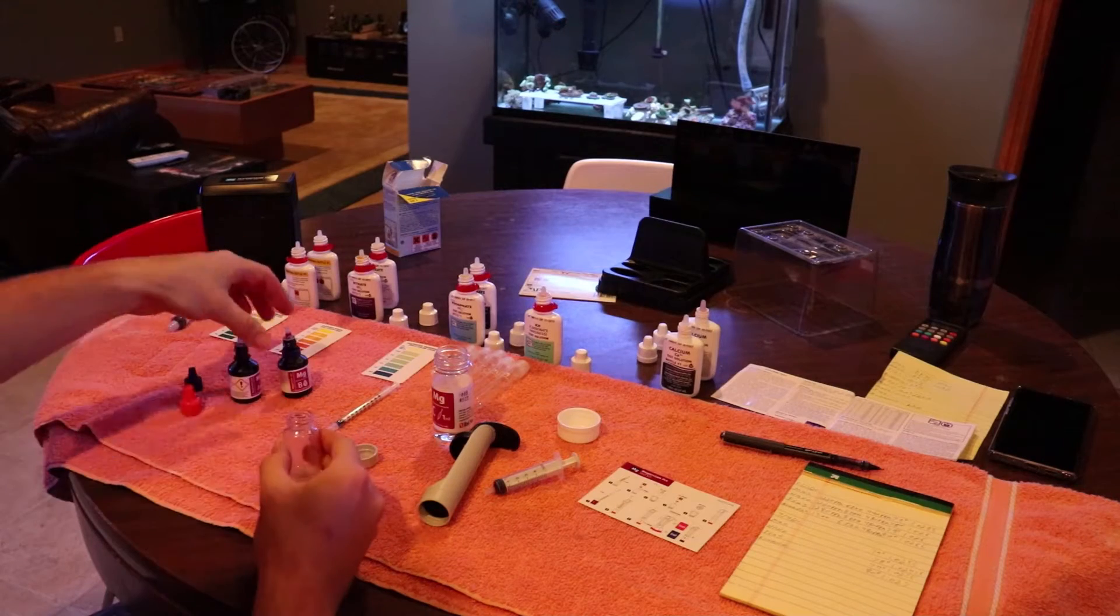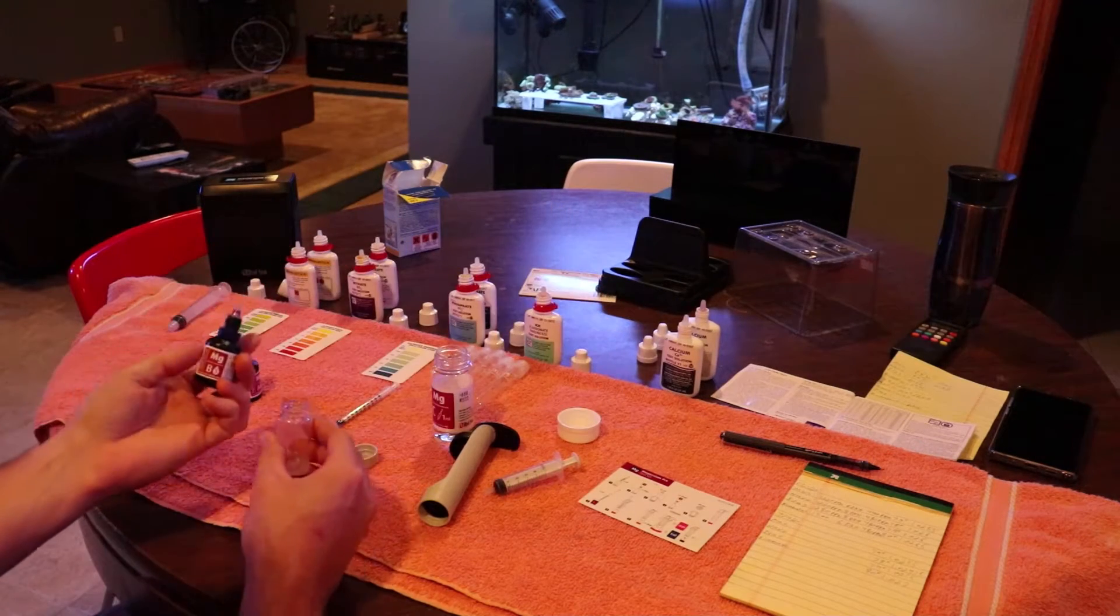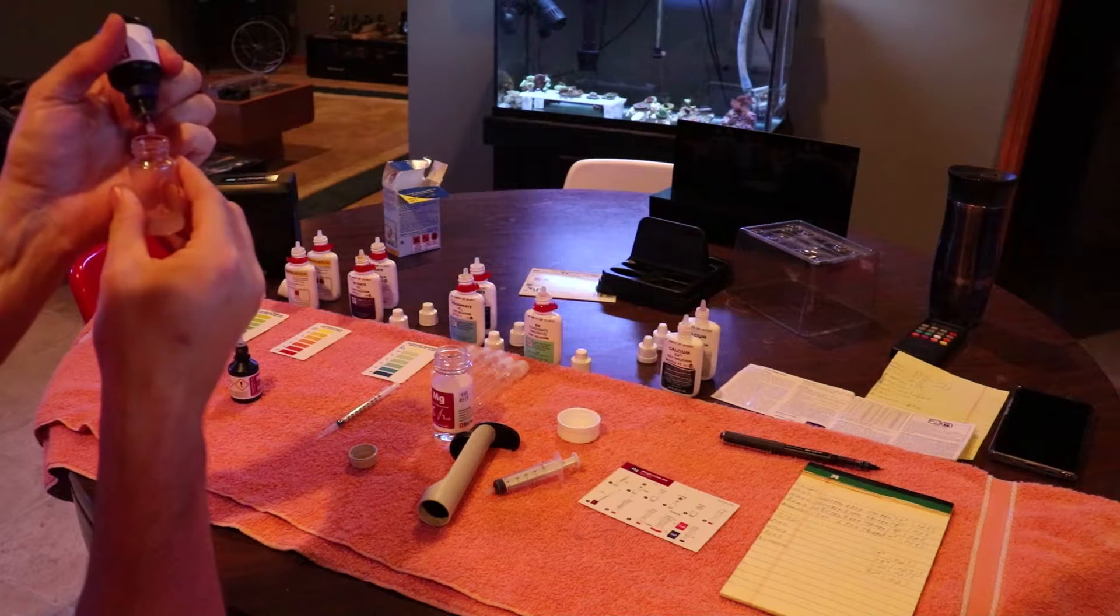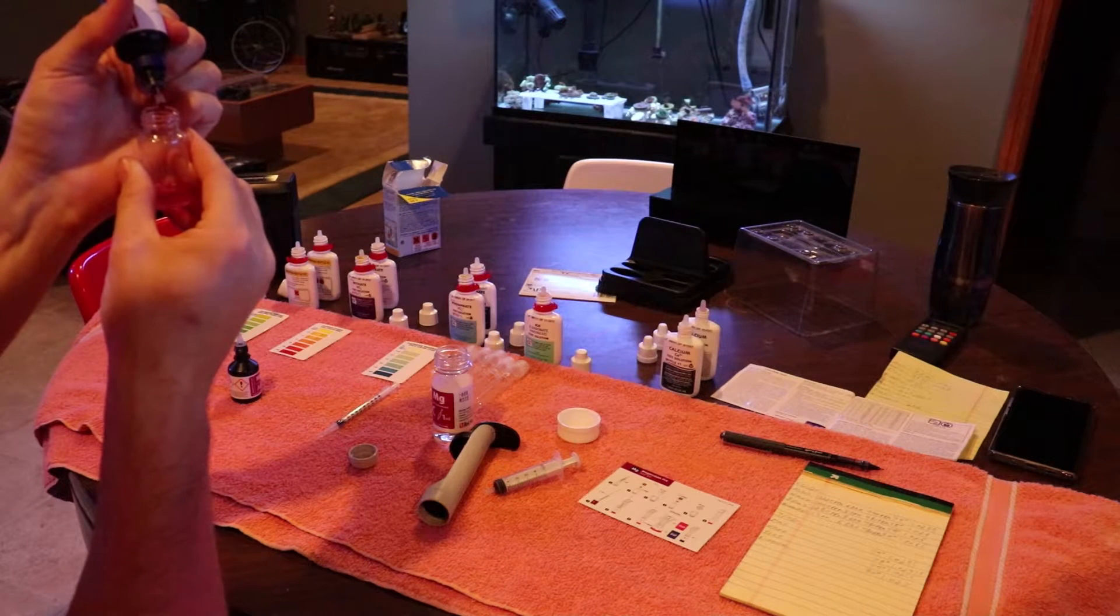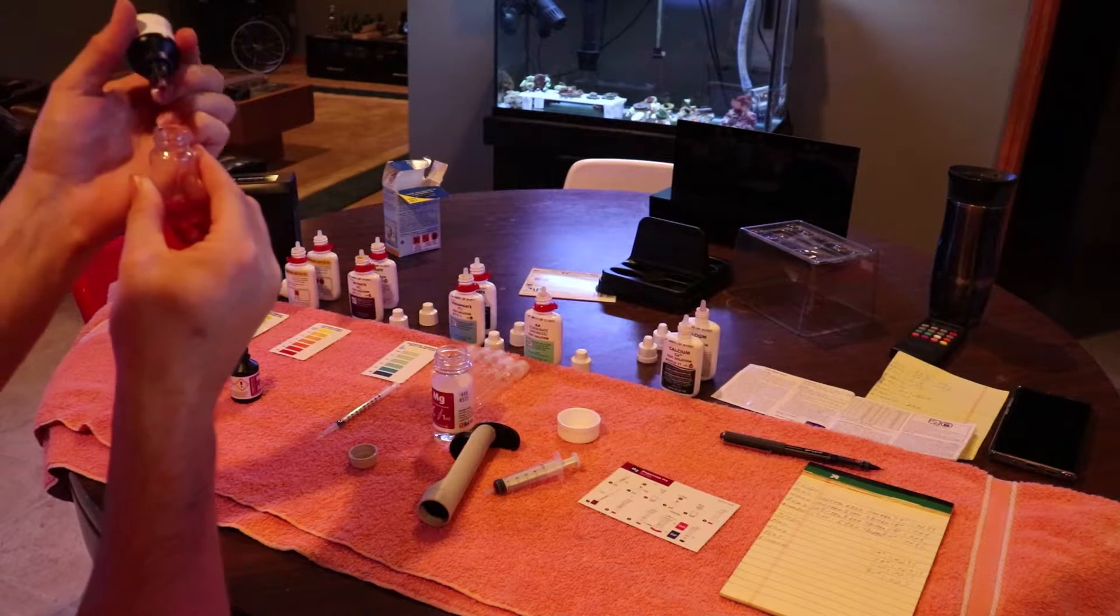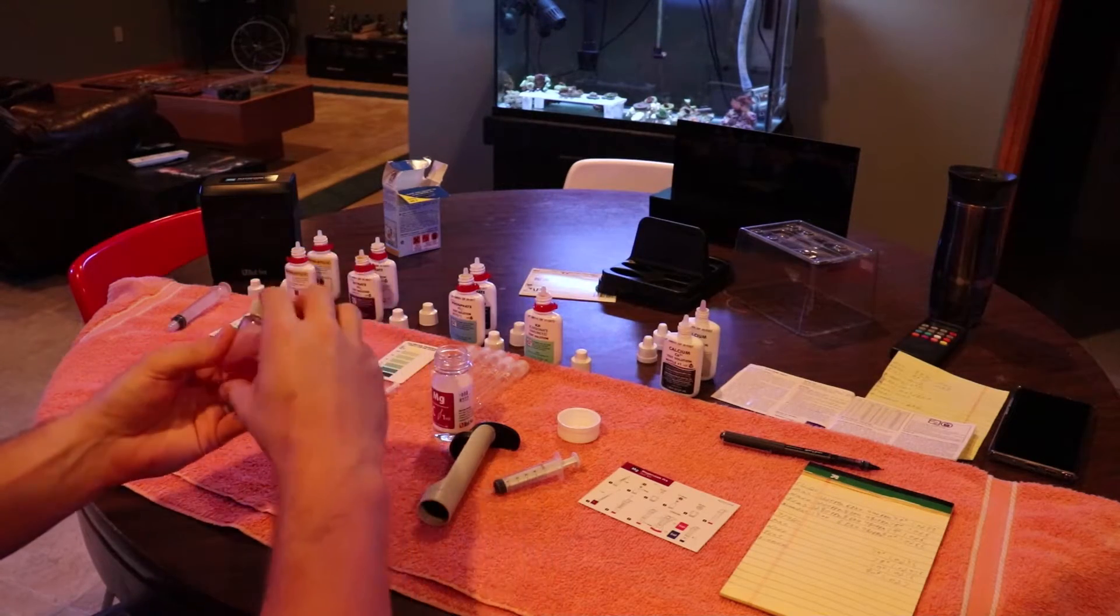You're supposed to wait 15 seconds in between each drop and shake it, but I usually just do all five. You're going to go to reagent bottle B, add five drops and give it a little shake. Let it sit for about 60 seconds before you move on to the next step.